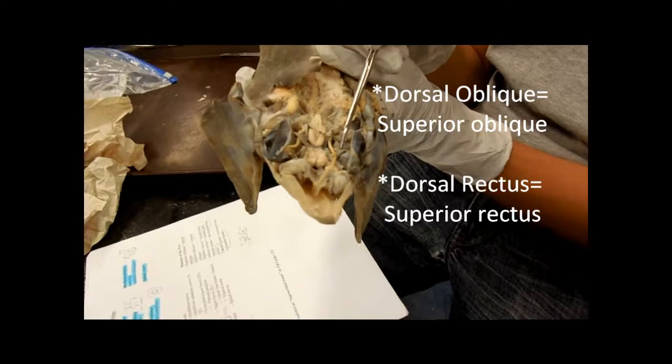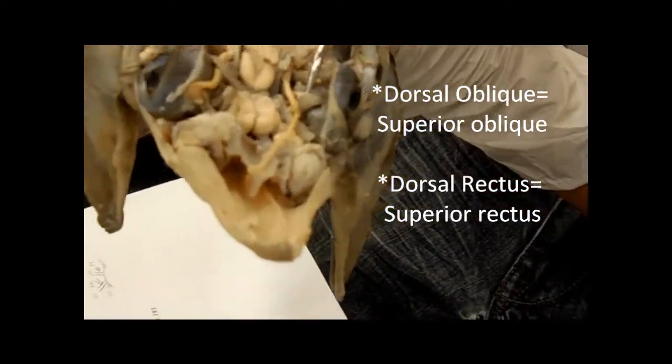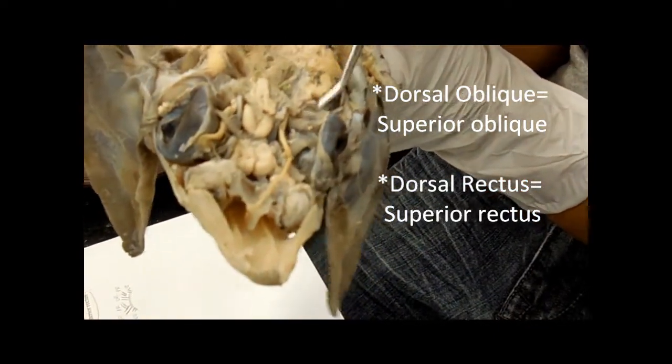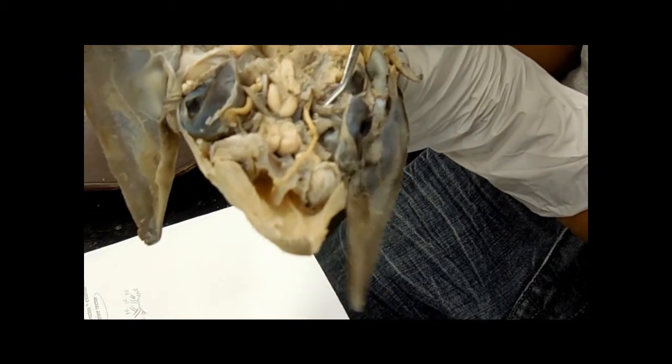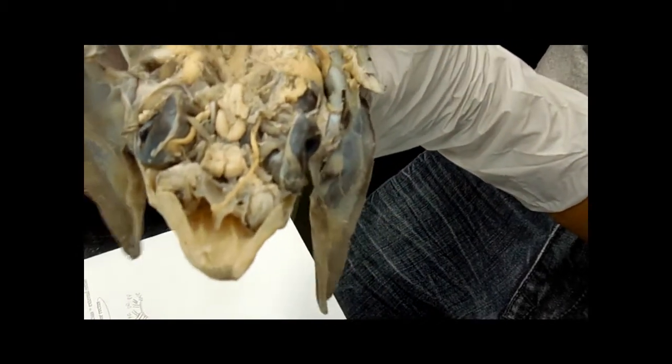This is the dorsal oblique, the front one, and this is the dorsal rectus. So the top one's the dorsal, bottom's the ventral. Dorsal oblique, dorsal ventris, dorsal rectus.